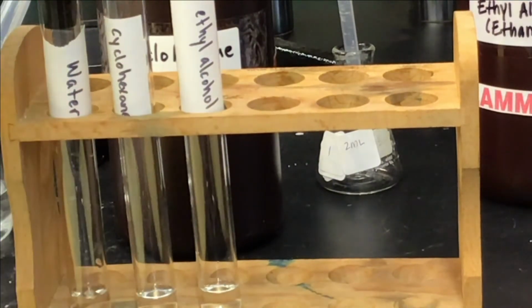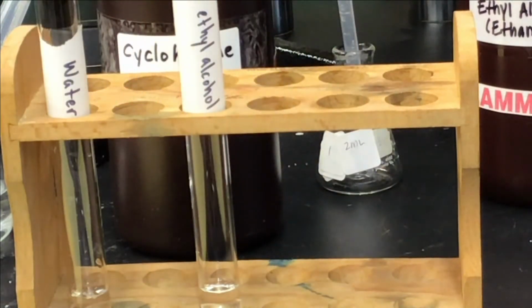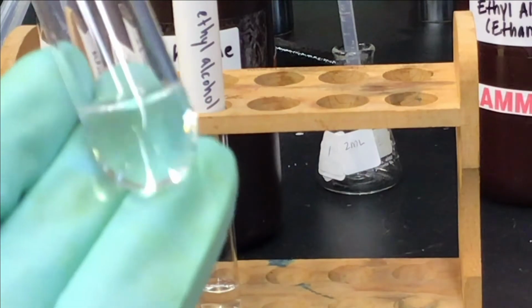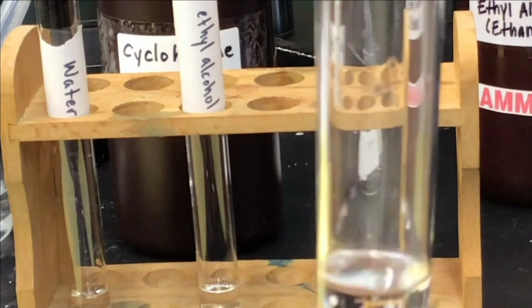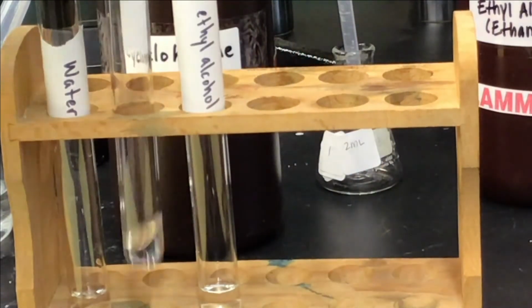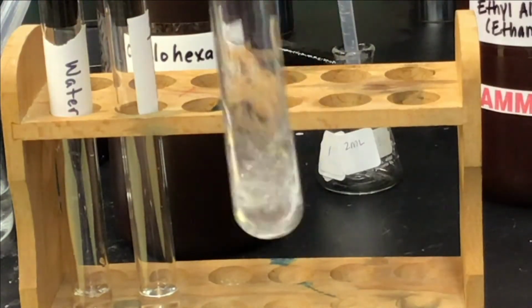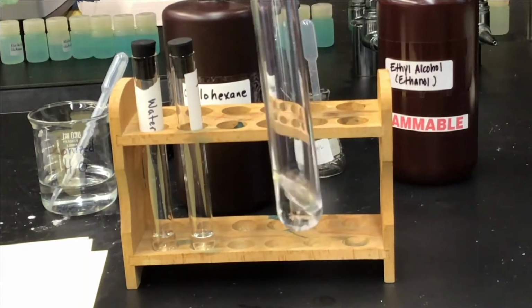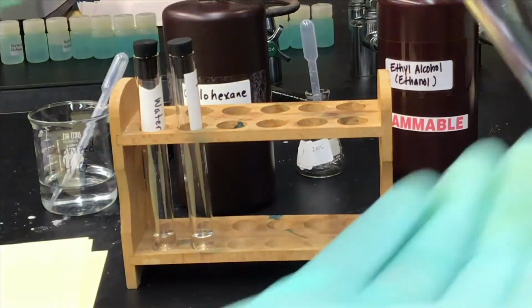Now we'll complete the same procedure with our cyclohexane test tube. Right away, the naphthalene dissolves really quickly in our clear colorless solution. There are no remaining crystals. We are fully dissolved. And now we take our final test tube of ethyl alcohol and naphthalene and shake just like before. And just like with the cyclohexane, the naphthalene quickly dissolves in our clear, colorless solution.